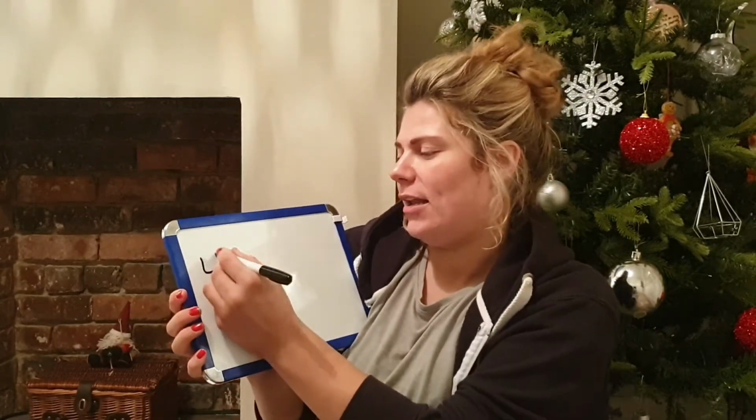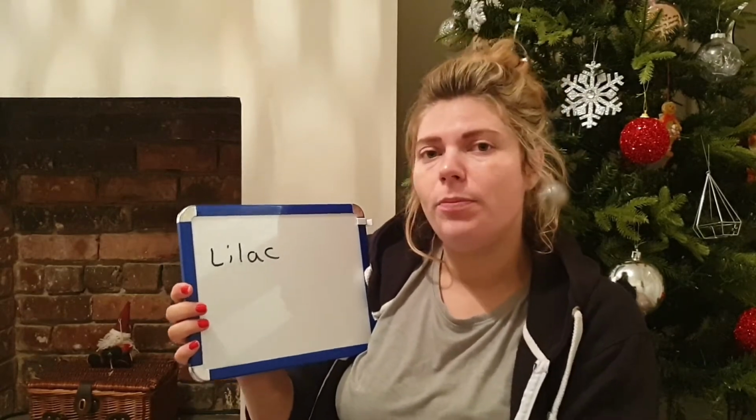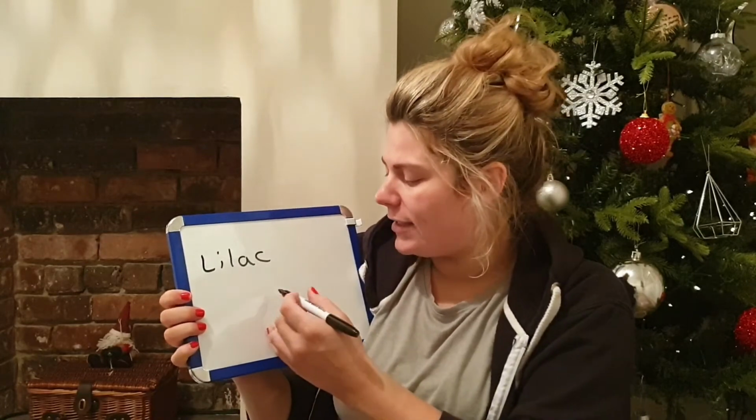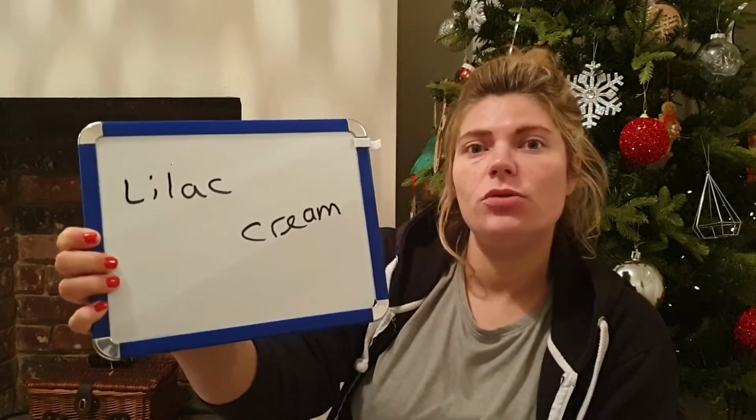You've got a solution and you're not sure what it is. You put it in a flame test and it turns lilac. And then you put some of the solution, you mix it with silver nitrate and it turns cream. What is in that? What is that solution?